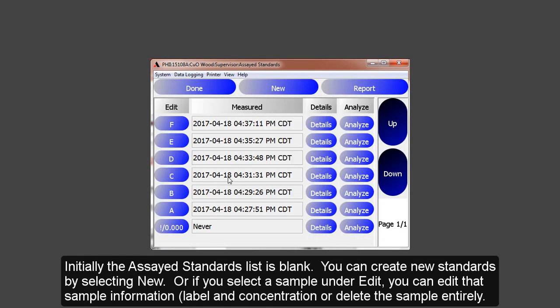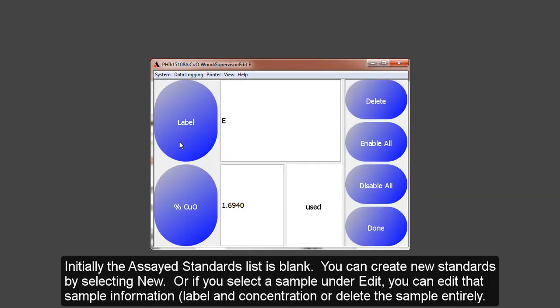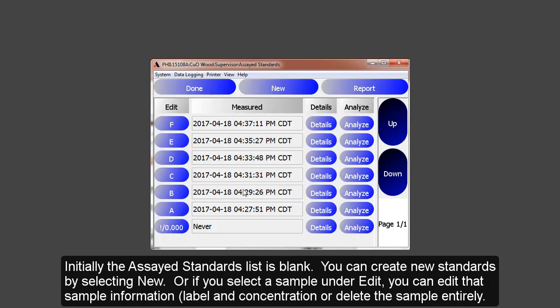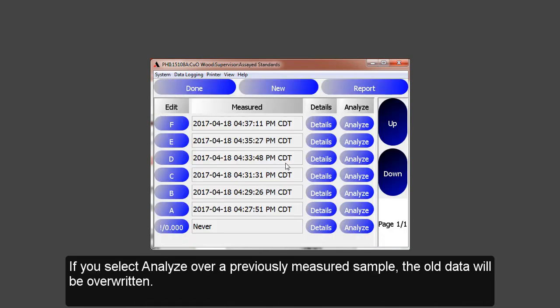Initially, this list is left blank. You can either create a new sample or you can edit existing samples by selecting the label under Edit. Or you can delete the sample entirely. If you select to analyze over a previously measured sample, the old data will be overwritten.